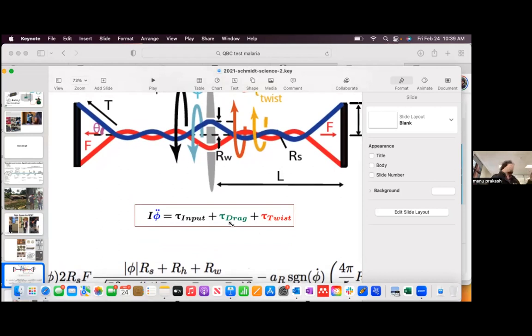But as you build the spin, it has enough inertia that it will keep going and it will self-twist itself in the opposite direction. So when I go here and I let go just around that time, I can let the inertia of this object go and twist it in the other way. And then I pull it again, so I can put oscillatory input in it and I never have to rewind. It always winds back up again.